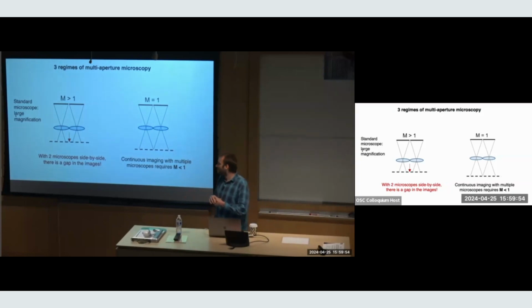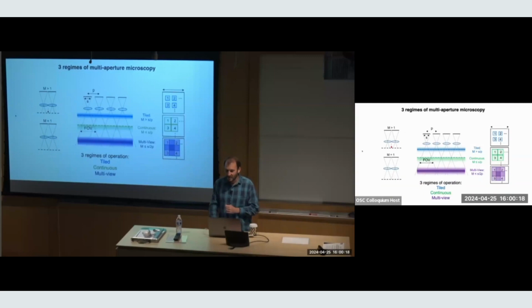But over the last 10 years or so, pixel sizes have dramatically shrunk. And so the pixels we're using in our systems now are 0.7 micron pixels. Previously, a lot of this work was with 1 micron pixels. And in that regime, you're now talking about resolutions where, if you spoke to a microscopist or biologist, they'd be like, oh, I can work with that. And so it's really these arrayed approaches for high resolution microscope imaging that are enabled by these very small pixel sizes.